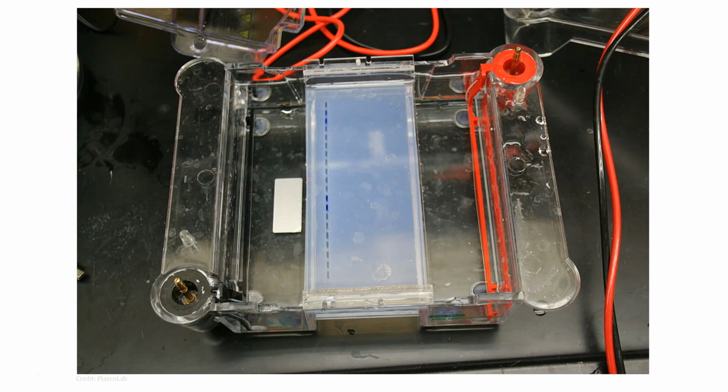Then we load this gel into something that looks similar to this. This is called an electrophoresis chamber. Electrophoresis, because there are two electrodes, the positive and the negative electrode. I can never remember which one is which. I think this is negative and this is positive. Electricity flows across this way through the fluid. There's fluid in here into which we'll put the gel.